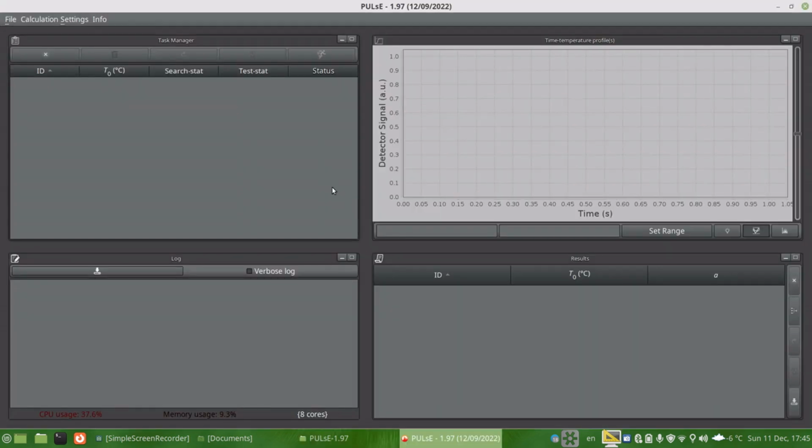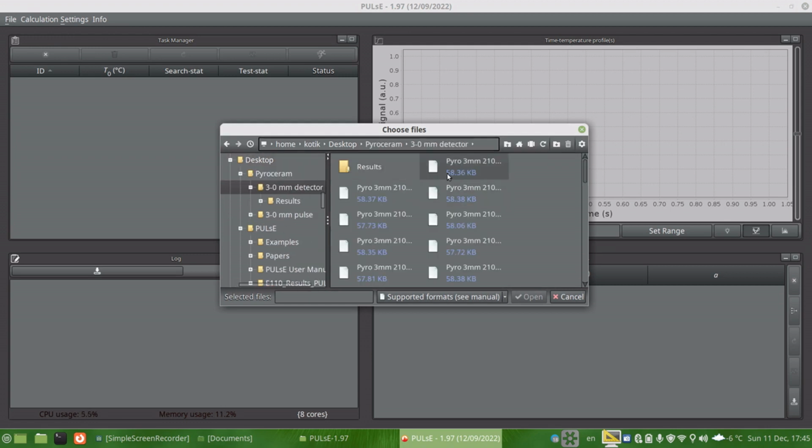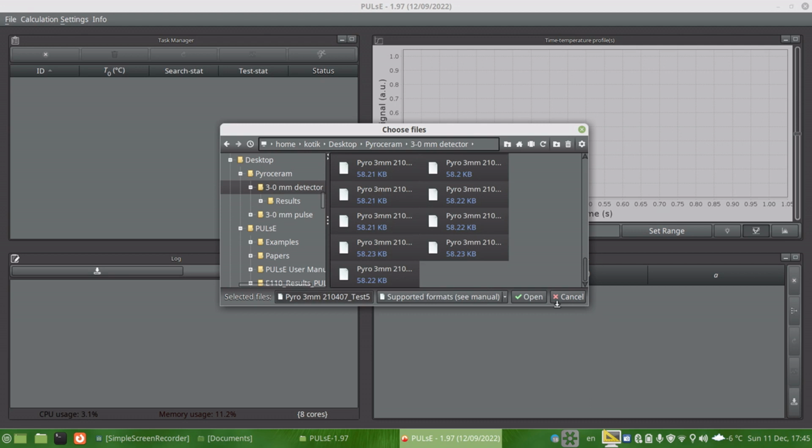And then finally a graphical user interface appears consisting of 4 internal frames and a top menu used to do operations with the data. Obviously no data shows up since this needs to be loaded first. So navigate to the main menu, click on File, then Load Heating Curves, then select the location for your data files. In this example, I'm going to show you what to do with data for a pyroceram sample. So we select all files here.